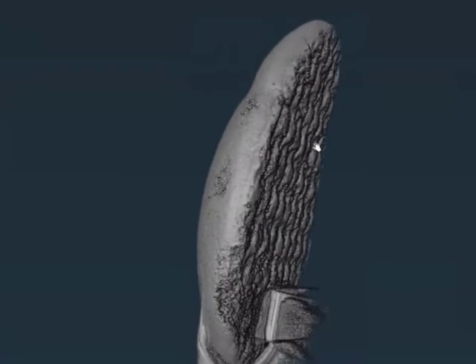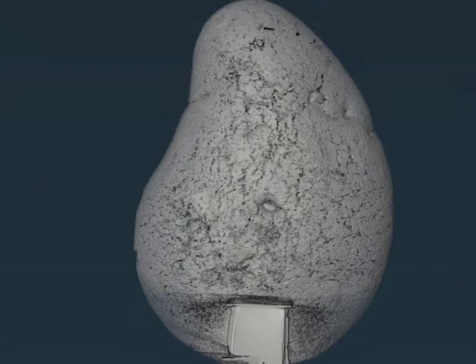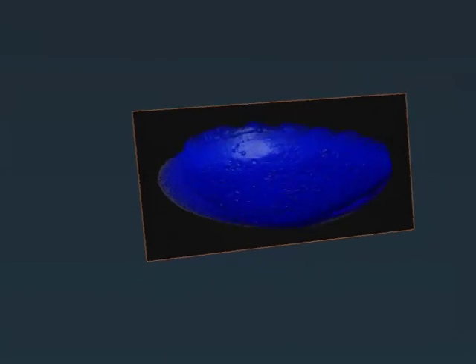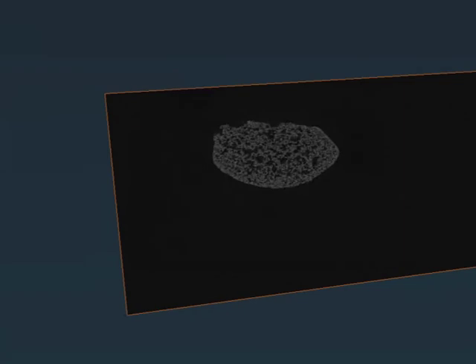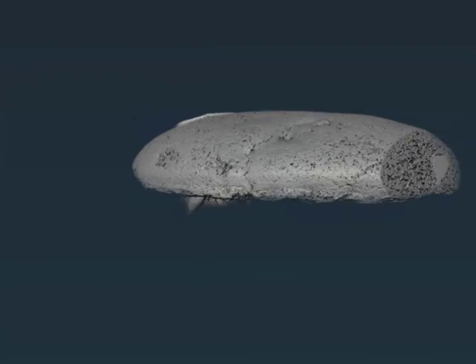We were able to reconstruct a single biscuit, having a little bit of trouble with the rendering here where squares keep disappearing. I really do like the shape of this biscuit. It's pretty interesting. And again, we have the porosity of the biscuit itself, and just like Francesco thought, the distribution of the chocolate chunks is very cool to see.